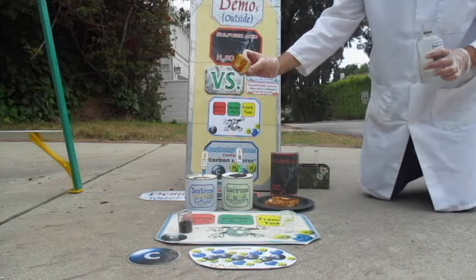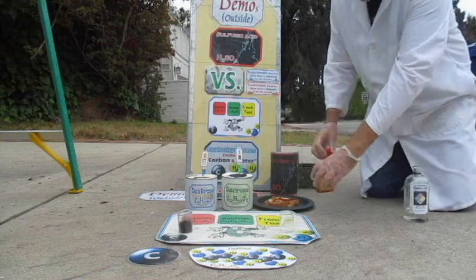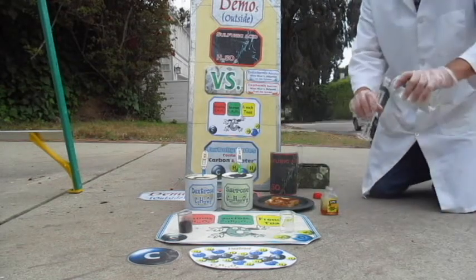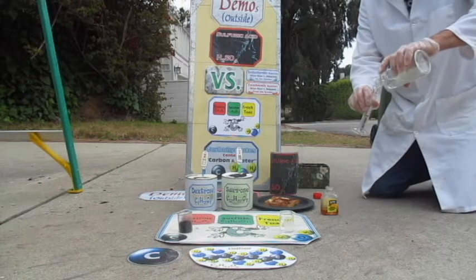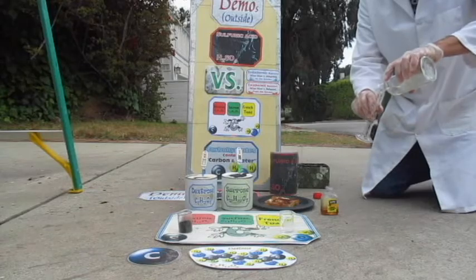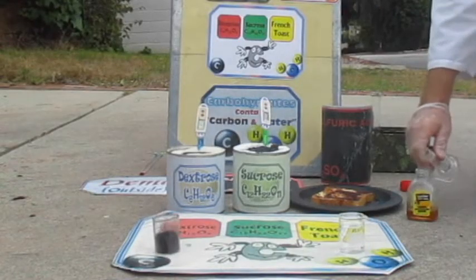And then one more thing I don't usually do. Well, I wonder if there are carbohydrates in honey. Let's try to pour some sulfuric acid into some honey. This is one I have not tried ever before, so we'll see how it works out. I'm just gonna pour about 25 milliliters in this honey. If it has a lot of carbohydrates, we should get some kind of reaction.